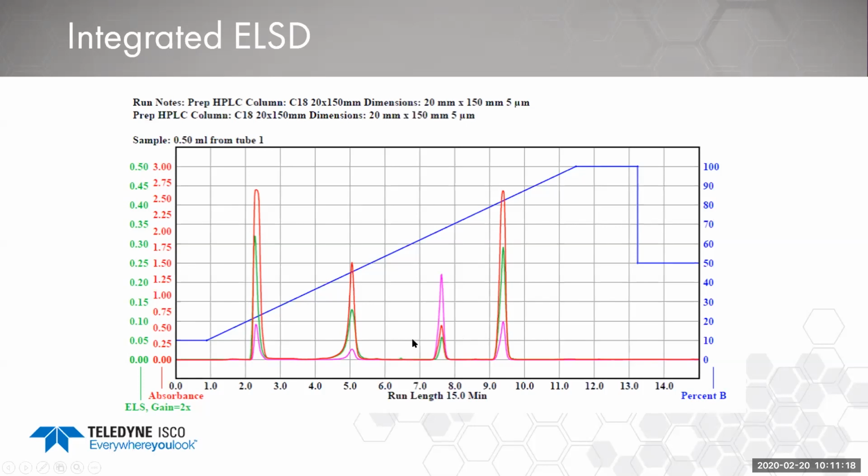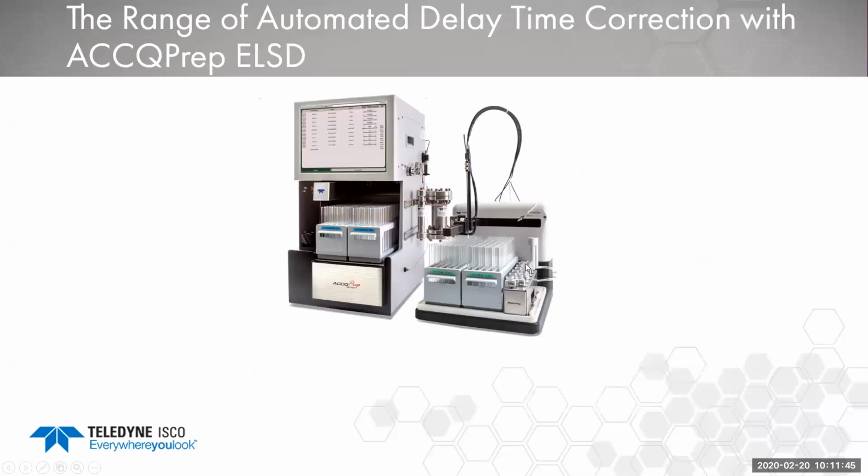If you have a solvent or some sort of a very small anomaly in your synthesis or your reaction, you might see a very strong UV response, but it might not actually be a real solid amount of material. So you might not see this green trace on your particular chromatogram. So this will help us to define how much material is actually there, typically by weight. I don't like to say by mass because, of course, that's going to be a couple of the next slides down.